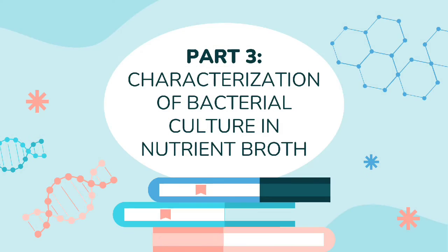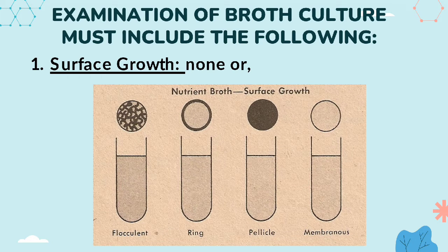The characterization of bacterial culture in nutrient broth. Nutrient broth is typically made of a powdered beef extract that contains peptones, or broken down proteins. The powder is dissolved in water, put in test tubes, and sterilized. The examination of broth culture must include the following.